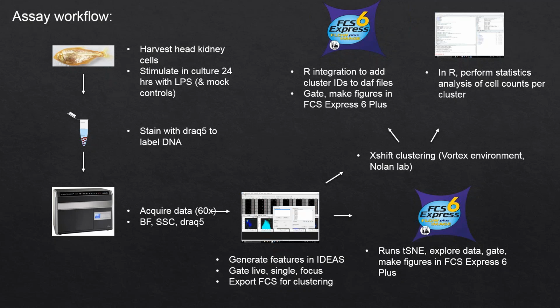So what's really nice is that when I do the clustering in X-shift, this is operating on FCS files, right? So what I'd really like to do is get cells assigned to clusters and then go back and be able to look at the images for those cells and try to understand, what do these look like, and do they have a morphology I can identify or use to build hypotheses.